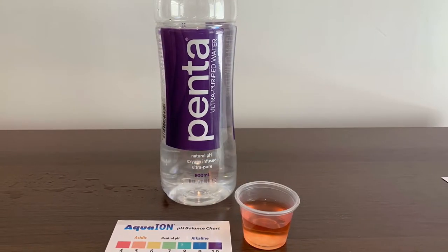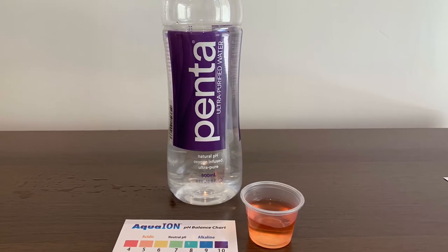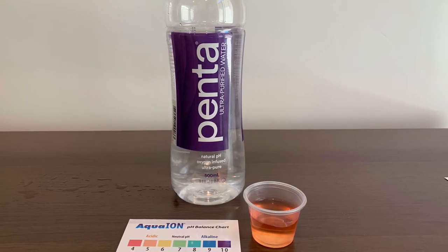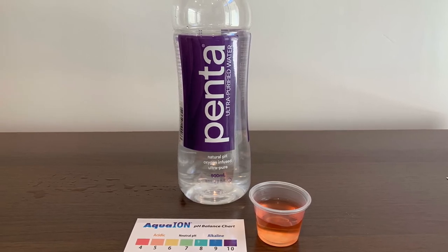This is Penta Ultra-Pure. Now let's test the pH.